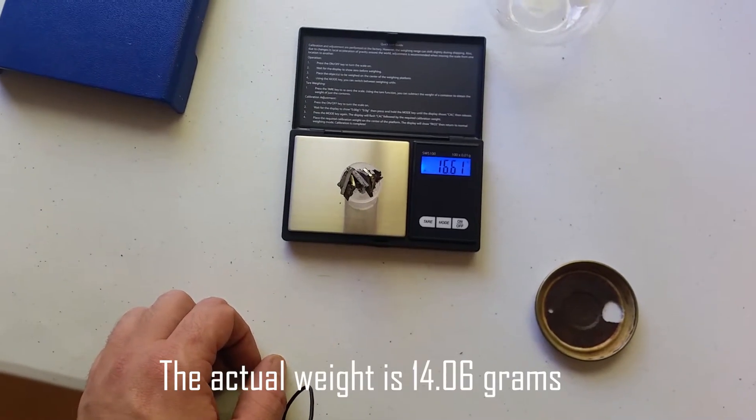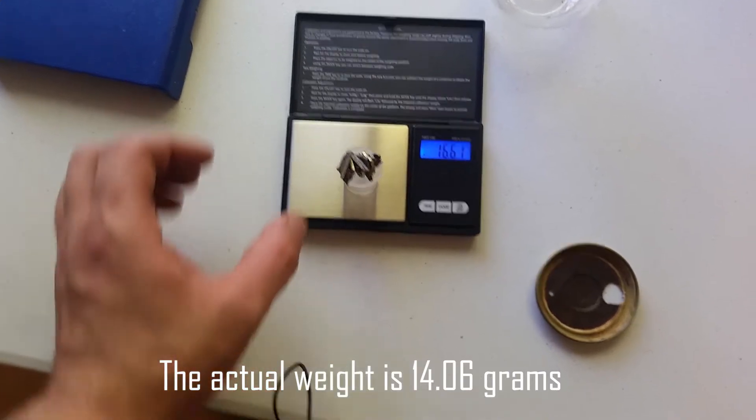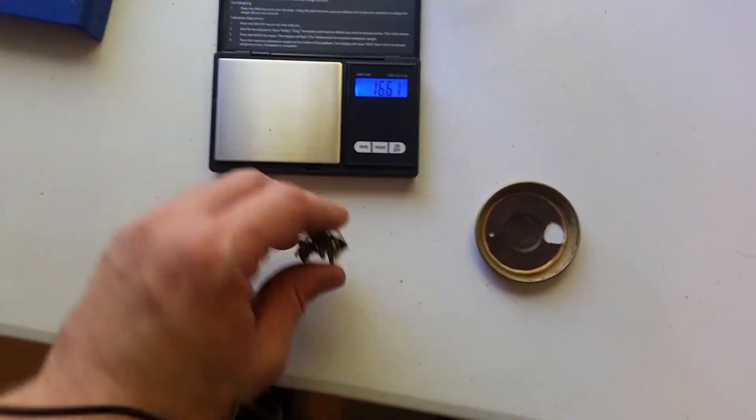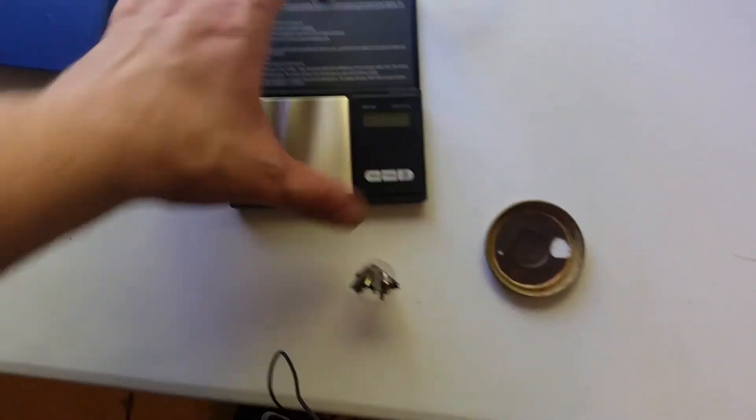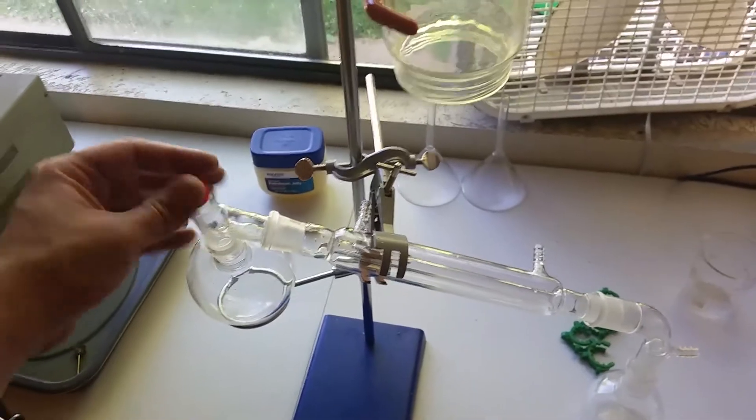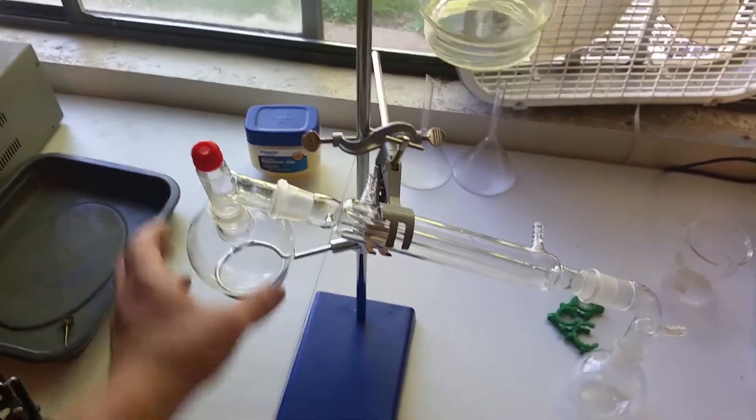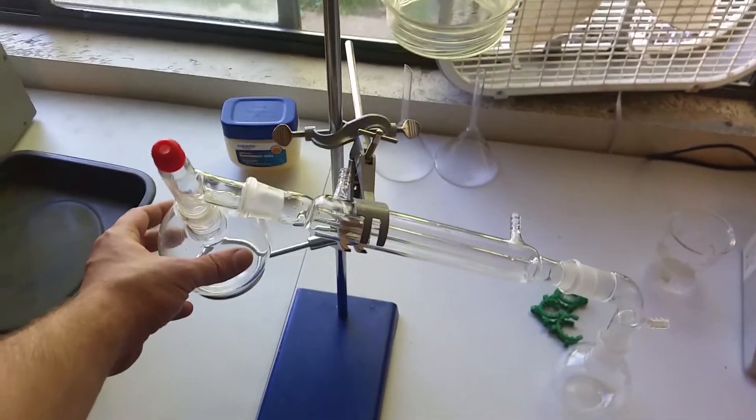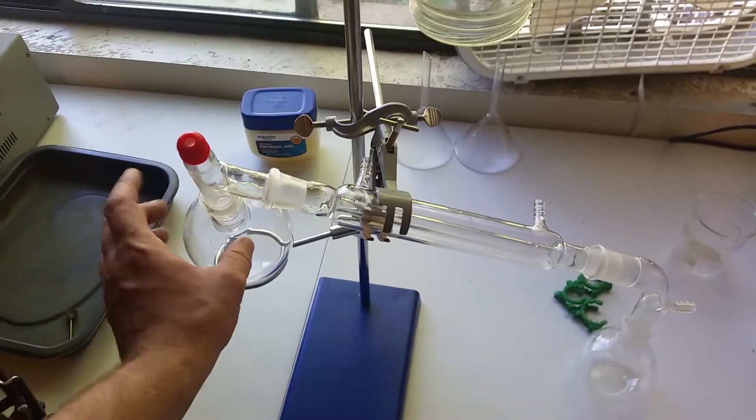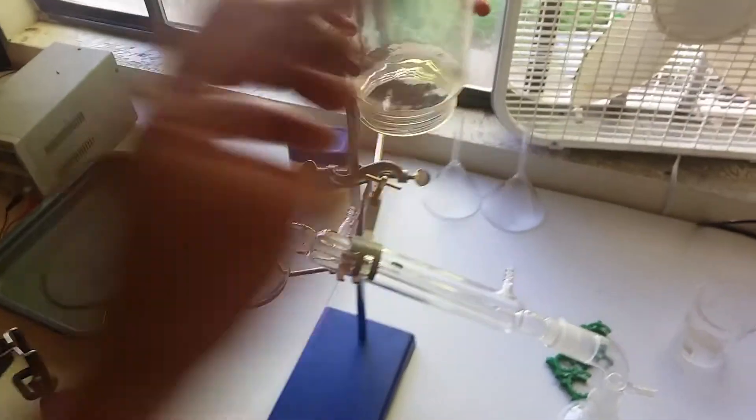It looks like 16.61 grams. Okay, so this is what I'm going to use to soak it in hydrogen. We're going to be putting sodium hydroxide and aluminum in here to generate hydrogen, and then pump it up to this jar.